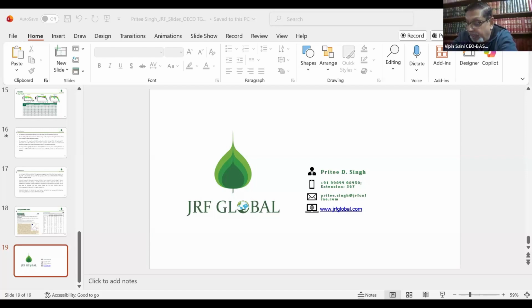Okay, fair enough. And how do these TG249 results correlate with the LC50 values obtained under TG203? That also has a restriction, as I said: endocrine and neurotoxic chemicals won't work for 249, but for other chemicals, not 100% of the data is the same, but around that we can use it as a pre-screening, OECD 249, as I said, not only here but also in academia and in other CROs.